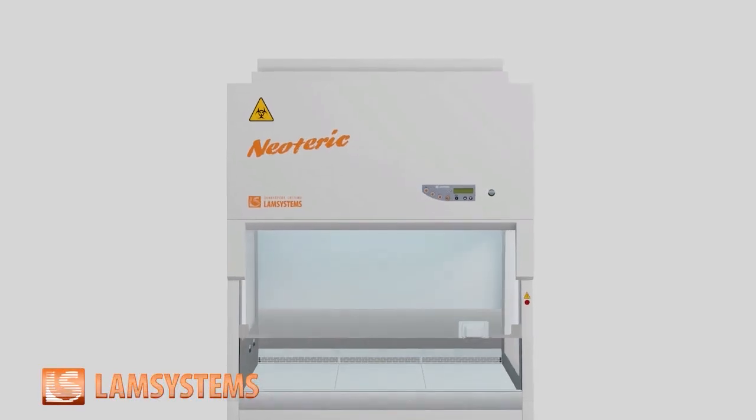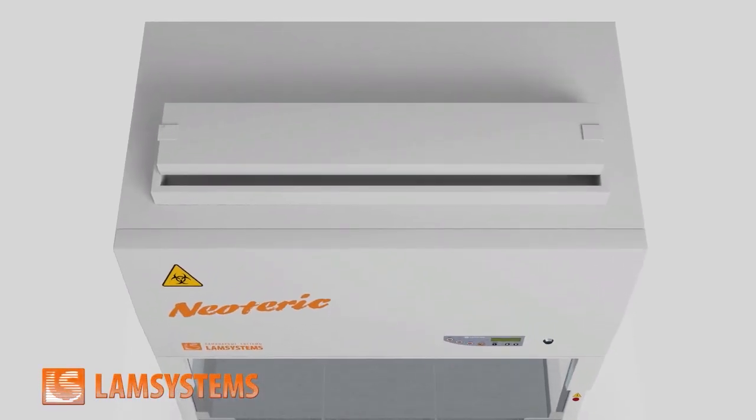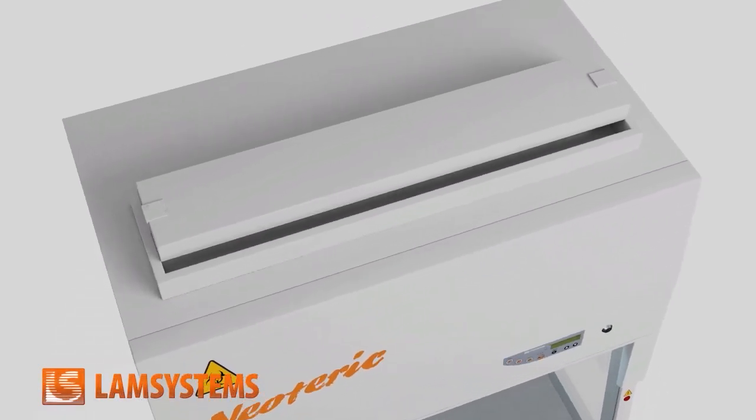The exhaust filter is equipped with a valve which is used to balance the incoming and downward airflow and prevents an accidental overlapping of the exhaust door with foreign objects.